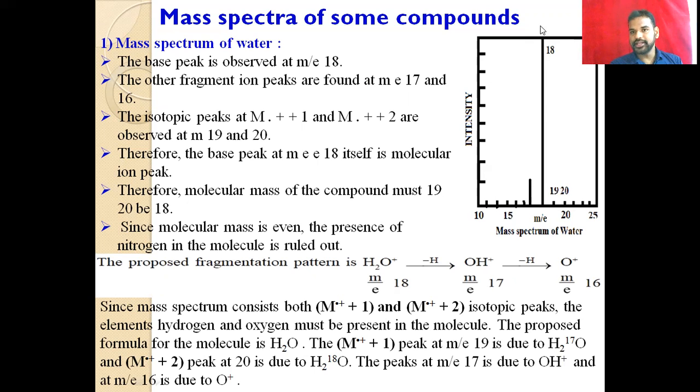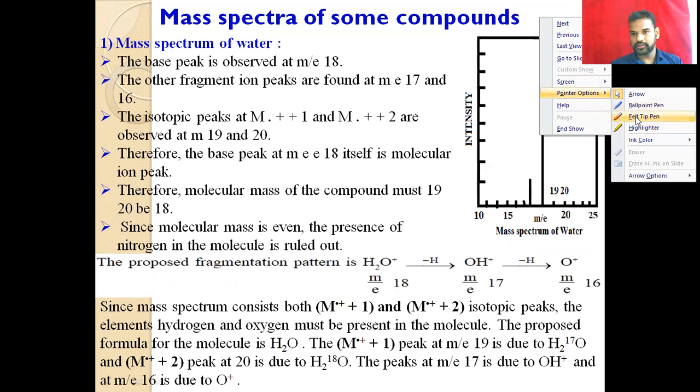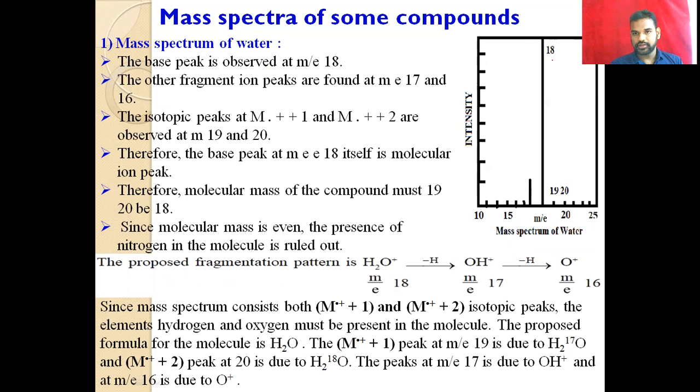The height of the peak indicates the intensity. We take the intensity of the molecular ion peak or base peak as 100%.